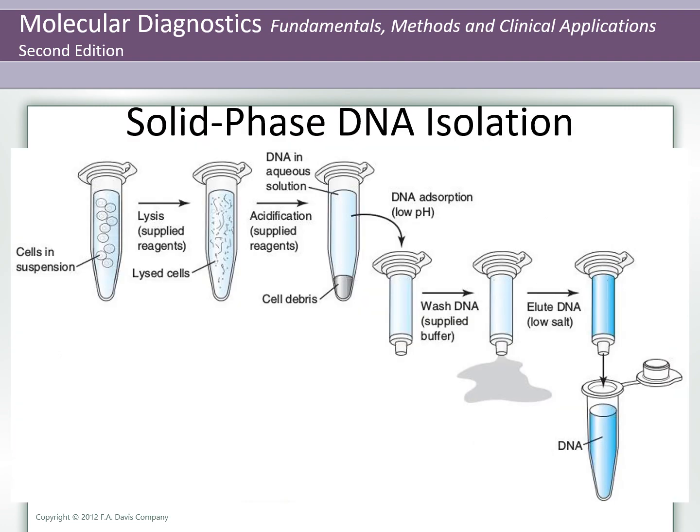Preparation of samples for isolation of DNA on solid phase media starts with cell lysis and release of nucleic acids, similar to organic and inorganic procedures. Specific buffers are used to lyse bacterial, fungal, or animal cells. Buffer systems designed for specific applications are commercially available.